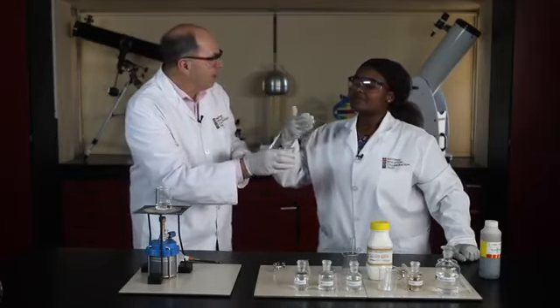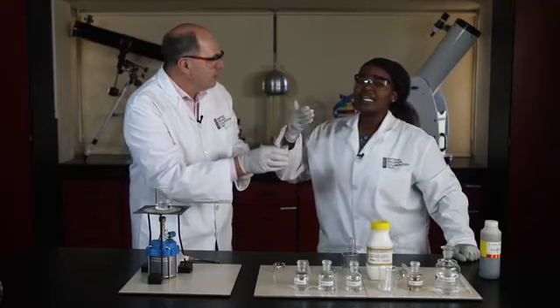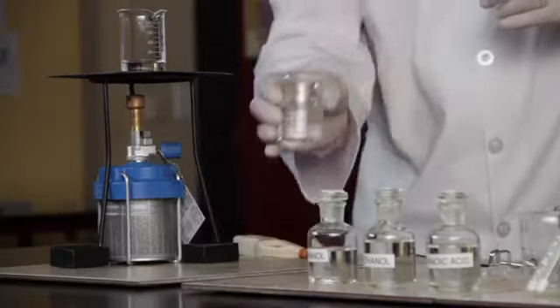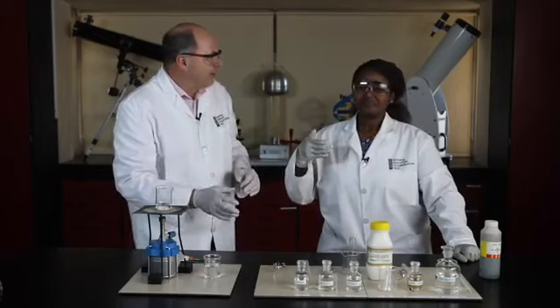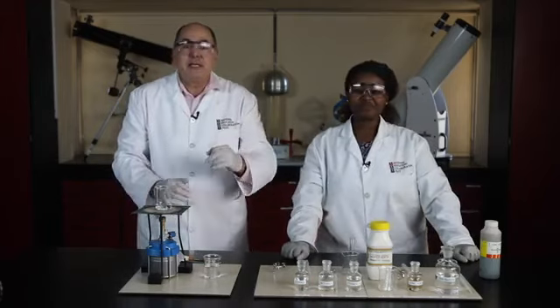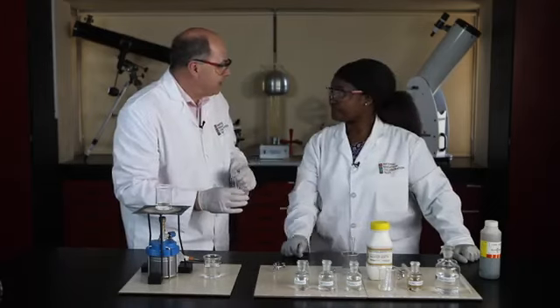What do you think it smells like? I think it smells like enamel paint. Yeah, paint thinners. That's it. Oh no, it's not very pleasant. I think we should find another, more pleasant smelling ester. Actually, it's a very distinctive smell. But I'm sure there are other esters that have a much better smell.